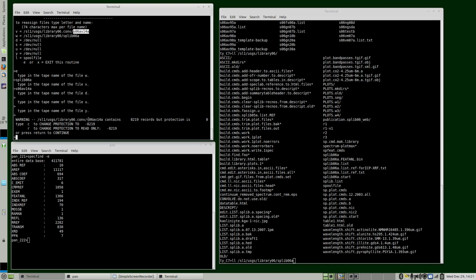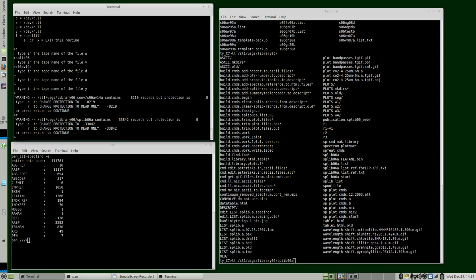You can override that, but it's not a good practice, so that you only write to a file that's in your own directory. That way, if multiple users are working on the same file, if it's not in that directory, they don't write to it, so you don't overwrite each other's results. So in this case, I'm just going to accept that. Same with the next one.